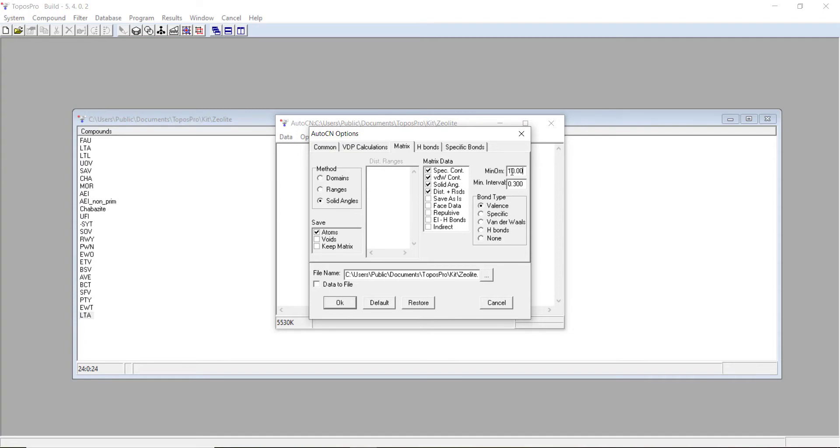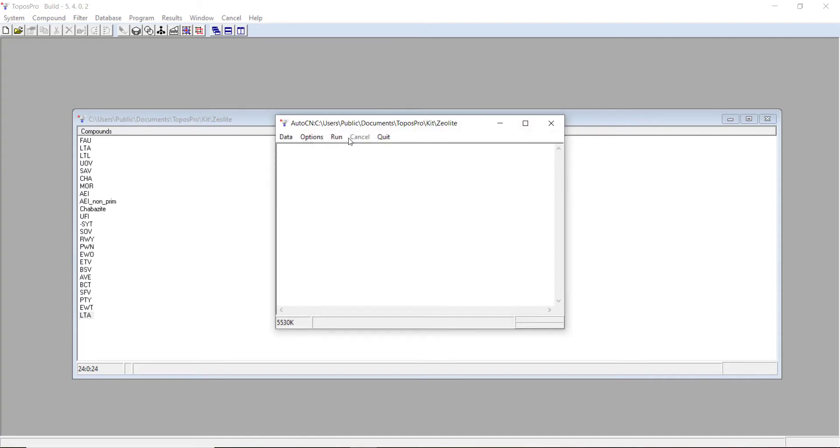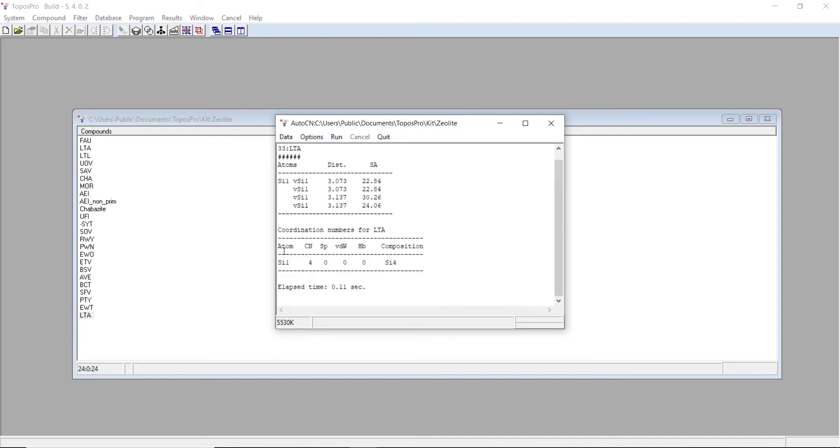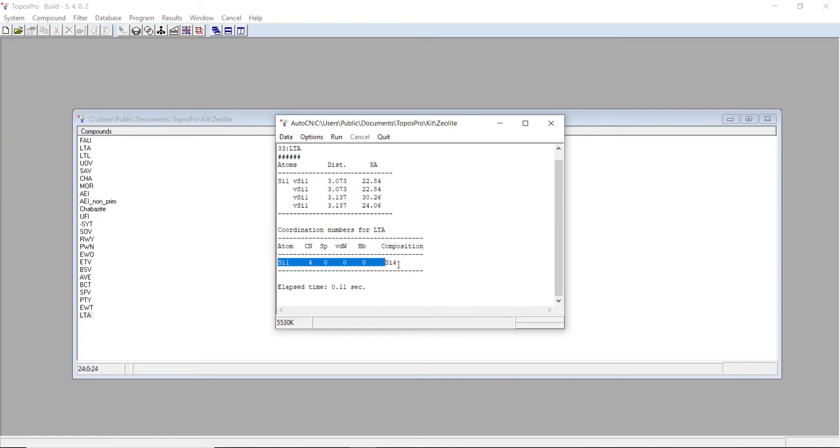Minimum omega of 10 is probably quite good. We'll press run. You can see here that the silicon has a coordination number of 4, which you'd expect in a tetrahedral framework. If you have an interrupted zeolite framework, sometimes you have coordinations of 3 or 2.